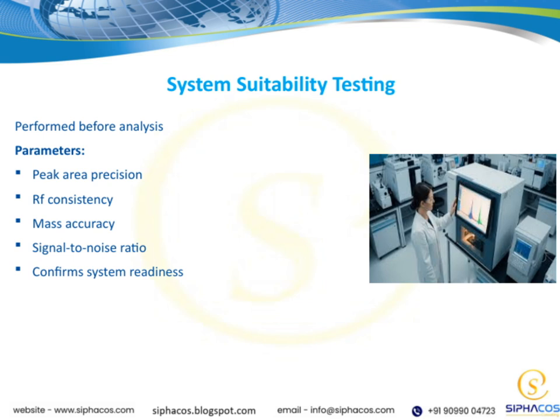Additionally, we evaluate the signal-to-noise ratio to confirm that our signals are strong enough to distinguish from background noise. Altogether, these parameters help us verify that the system is ready to produce valid, reproducible results for our analysis, maintaining the integrity of the entire process.